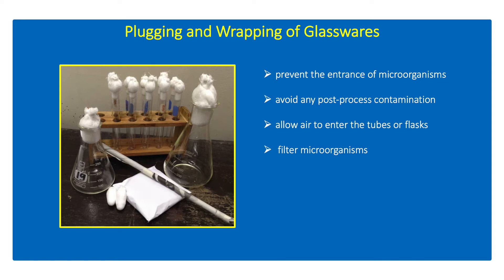After plugging and wrapping the glasswares, they are then subjected to sterilization.